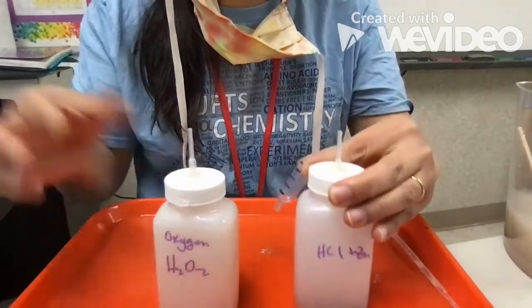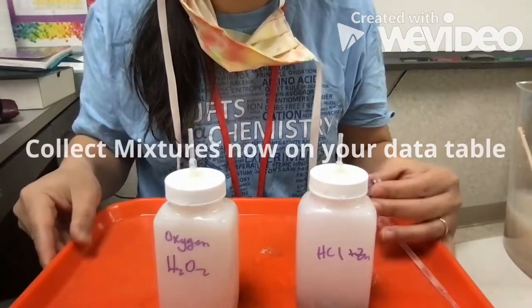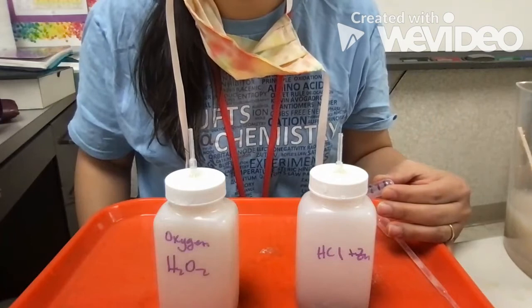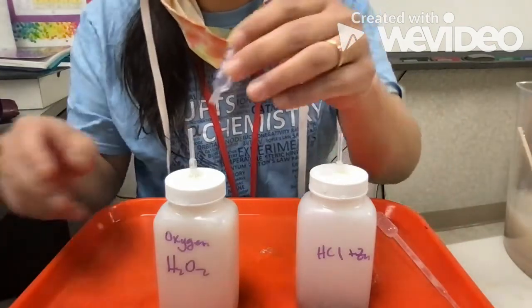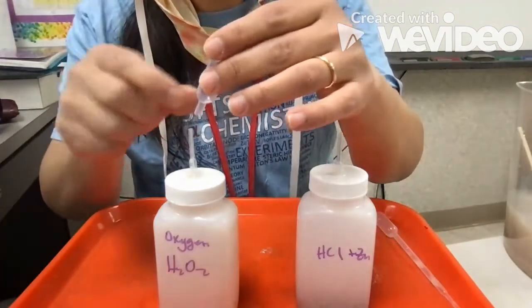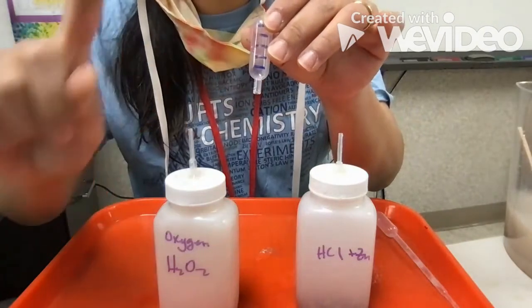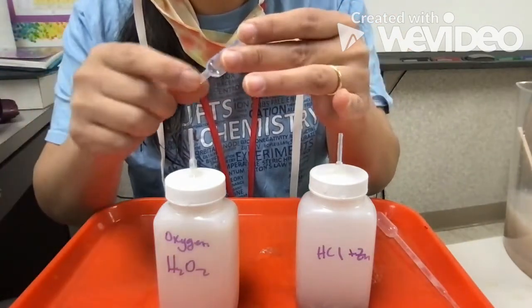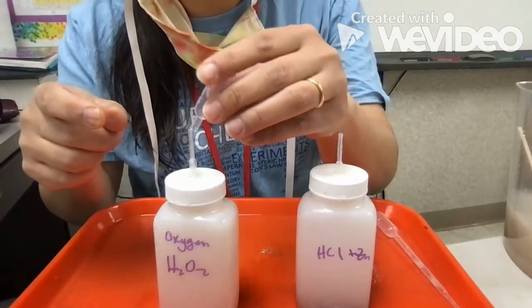Okay, so after you do pure oxygen and pure hydrogen, now you're going to get a mixture of the two. So first, you're always going to collect the oxygen and then collect the hydrogen. Okay, so I'm going to first collect one part, and I'm just going to do one of the examples for you. You'll have to do all the ratios, but you're going to do 1 part oxygen.